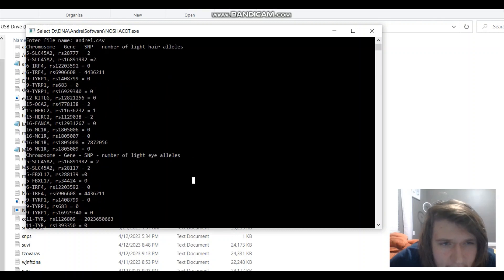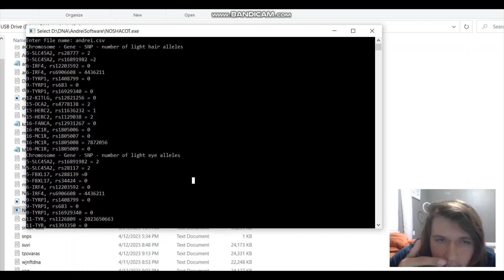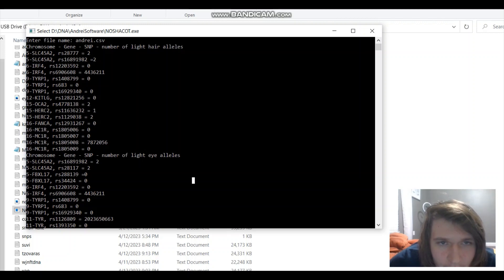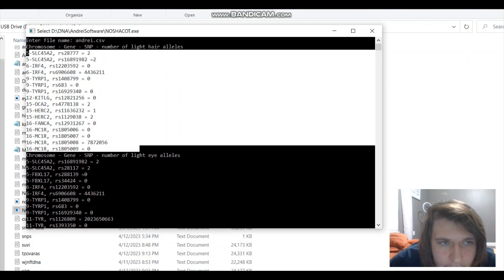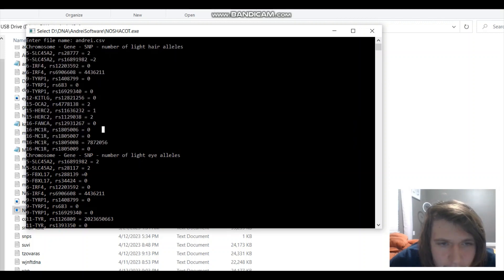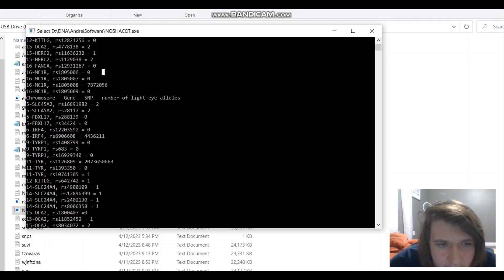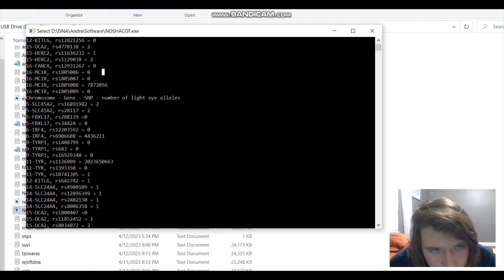Next, and this is not that important for hair color. I just kind of merged my own research with SNPedia's research. So, it's a pretty big database, but it's not as big as the eye color database and it's not as detailed as the eye color prediction.